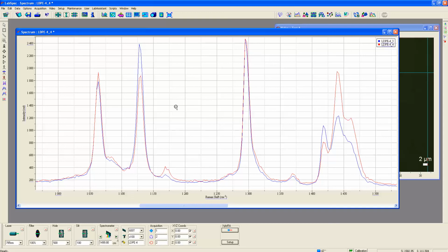Raman shift, you see the differences in the relative intensities of the other bands of an ordered or stretched polyethylene relative to one in which there has been no ordering and for which the spectrum, the red spectrum, one would find at any orientation. I might point out that if we were to rotate the first stretched polyethylene, we would see the spectrum change for that relative to what we see having the laser beam polarization aligned parallel to the stretch direction.